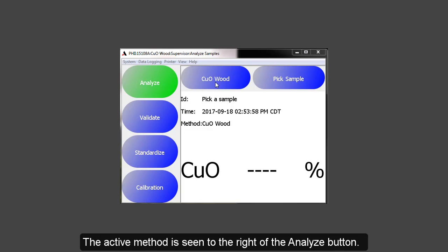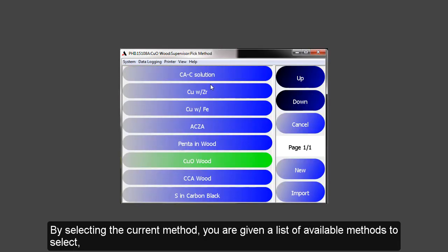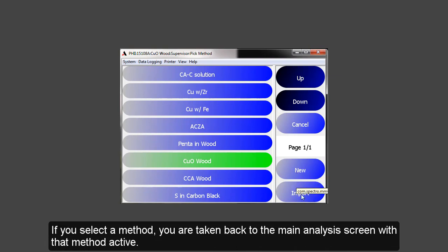The active method is seen to the right of the Analyze button. By selecting the current method, you are given a list of available methods to select, the option to create a new one, or to import a method from a method library. If you select the method, you are taken back to the main analysis screen with that method active.